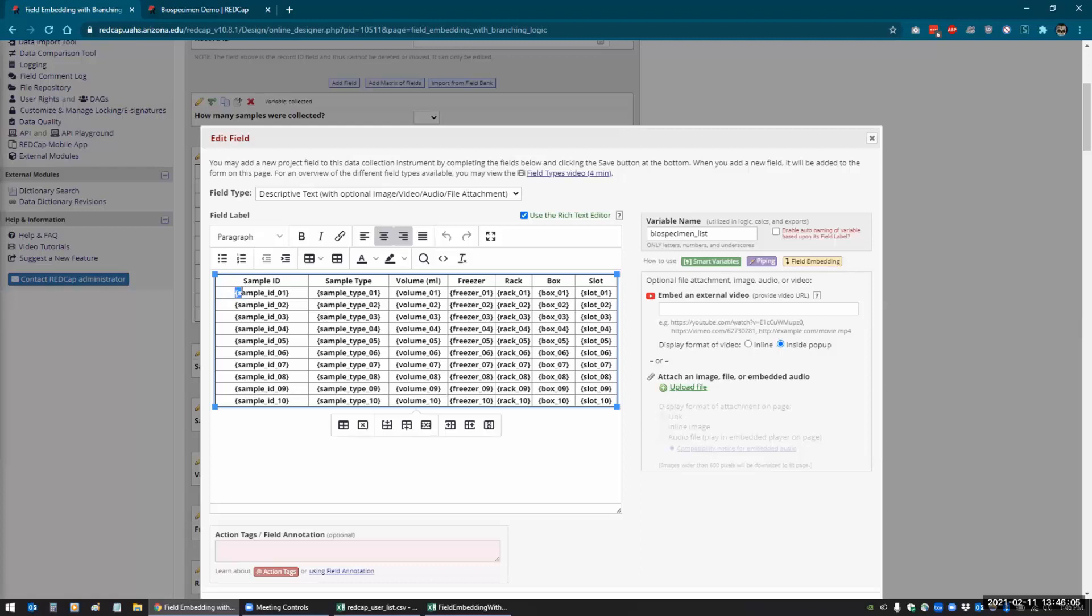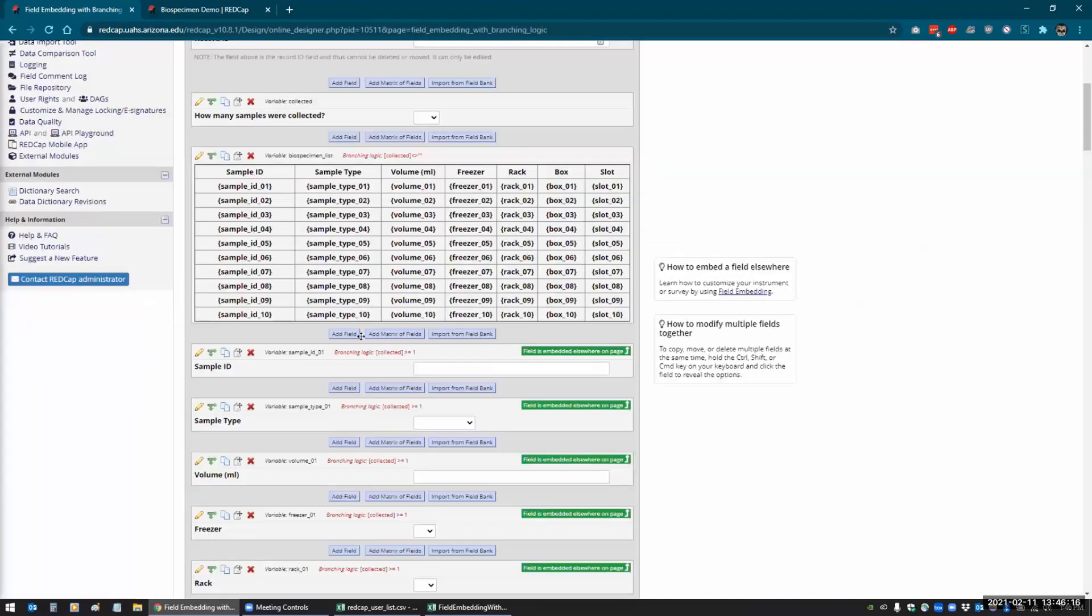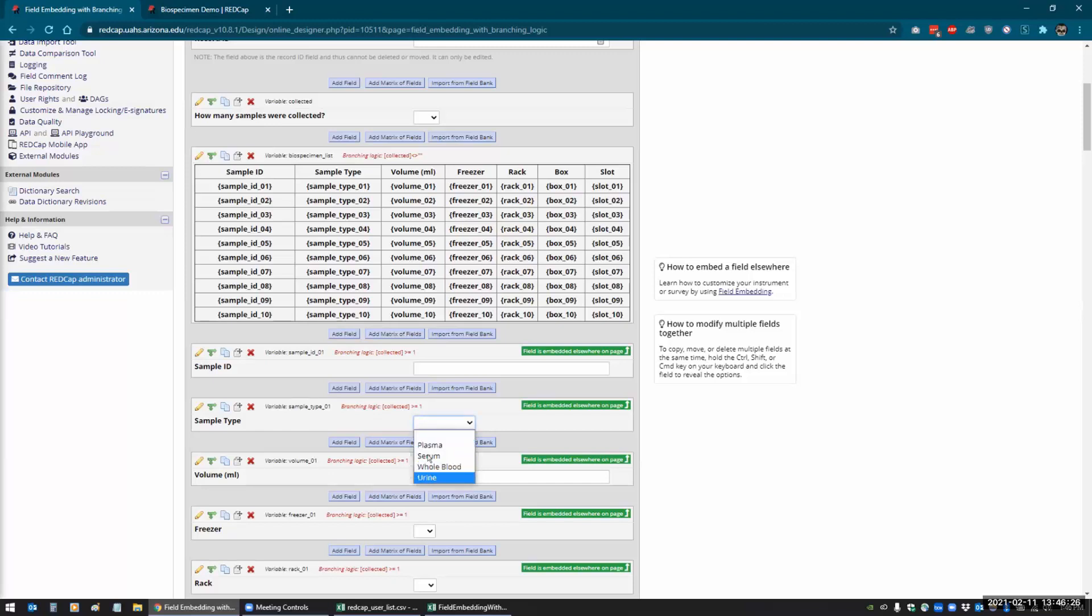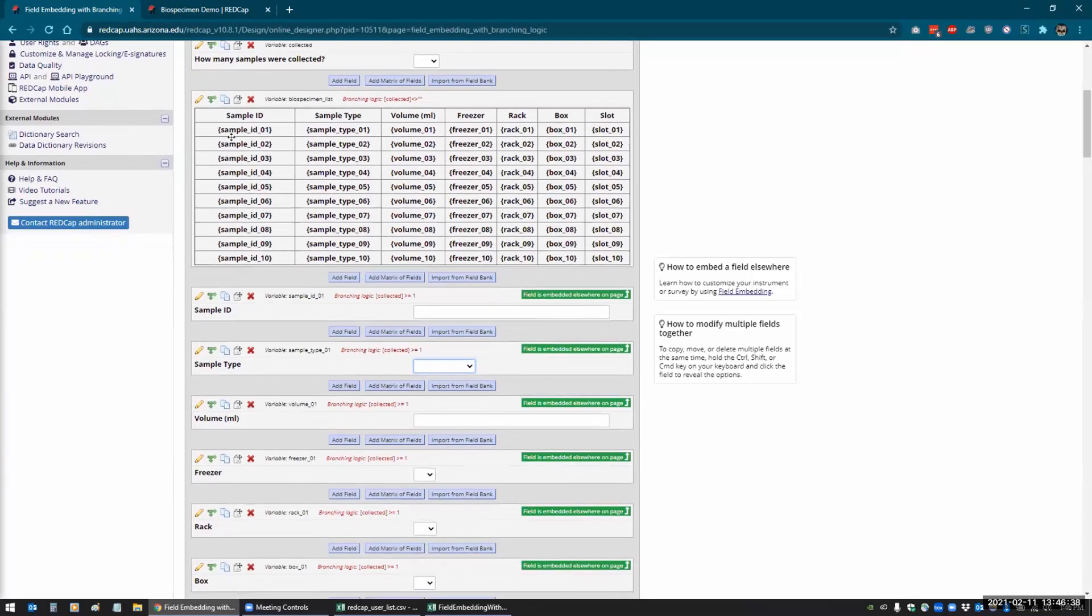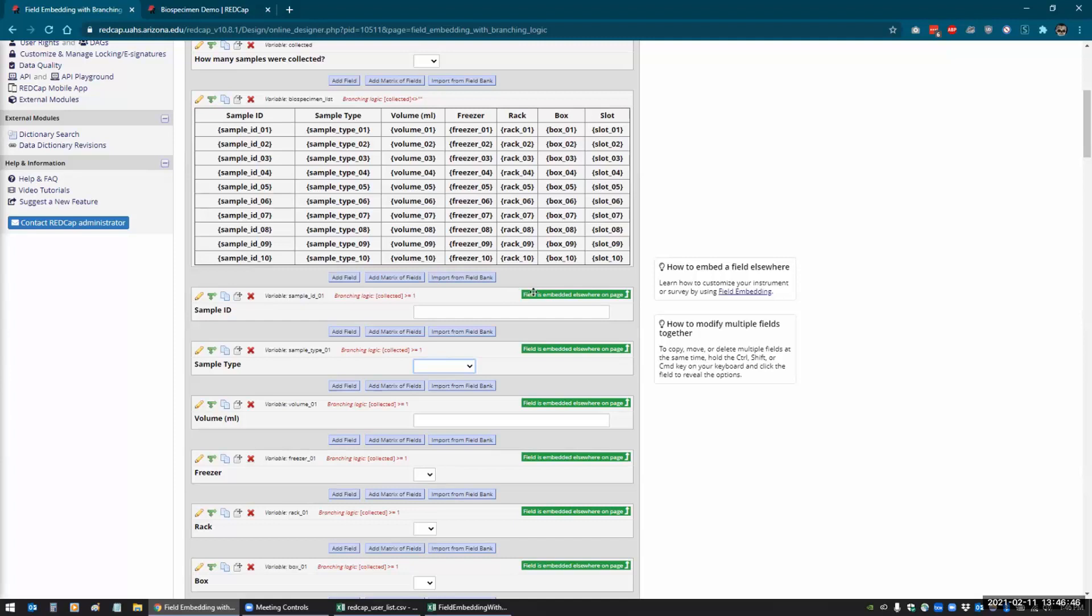So what I have to do is I just have to add the field name with the curly braces and that automatically grabs that field that I've created. So the sample ID one will go here, and it works for all sorts of fields. So like you can see here that I have a dropdown field for the sample type, and that automatically creates a dropdown field within there. Same thing with the radio buttons.